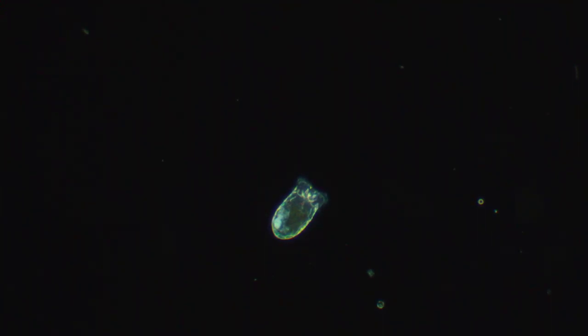A microscopic slide with uncooked food. You mean like raw meat or raw vegetables and things like that? And meat, as long as you slice it very, very thin. Like just get a really tiny little slice.